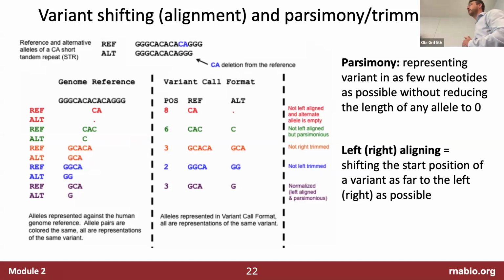You had a question. Okay. Going on what you're saying there, speaking to the human genome, if you start working with other species that have poorly annotated genomes, with dogs, we don't have any sequencing data that isn't polyadenylated, just because there's no real way to do ribosomal depletion.